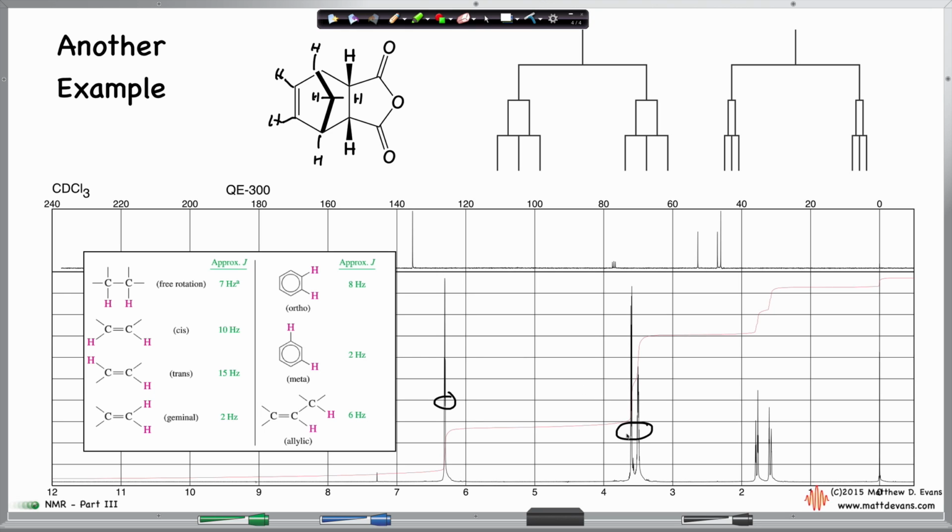They're going to be lumped in here with these other bridgehead hydrogens, which are lumped right next door. So all these are kind of mashed together right here. The interesting signals are these two right here. This is what I'm really interested in. And these relate to these two hydrogens at the very tippy top of the hat of this bicyclic compound.